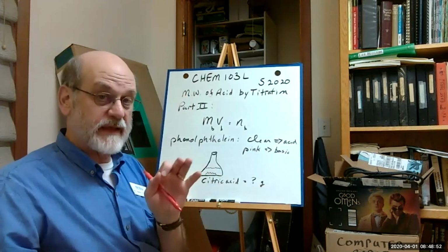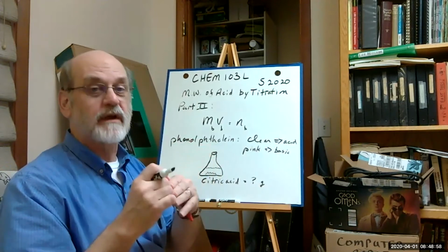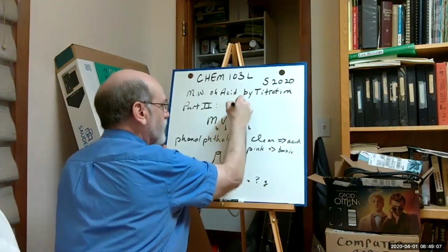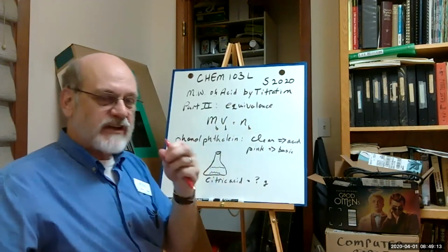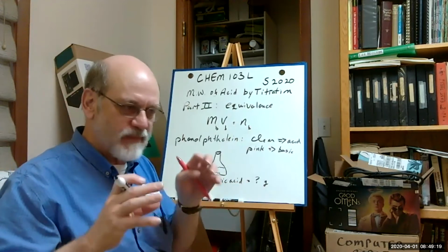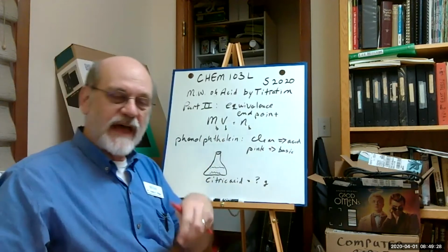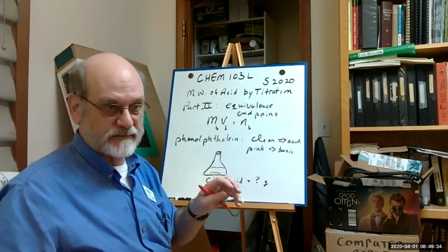Right, so the faintest pink is the best because that gets you closest to the actual equivalence point for acid neutralized by base. That's a distinction that we've made in the lecture. The equivalence point is the actual point where acid equals base, exactly, to as accurate a measurement as you can make. Whereas the end point is that point at which the color changes. You try to get these two as close to one another as possible. They won't be exact.